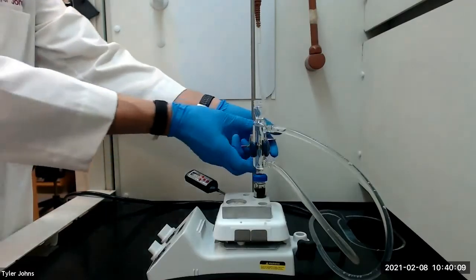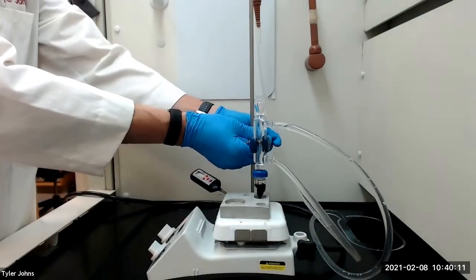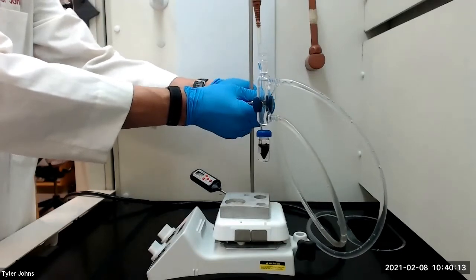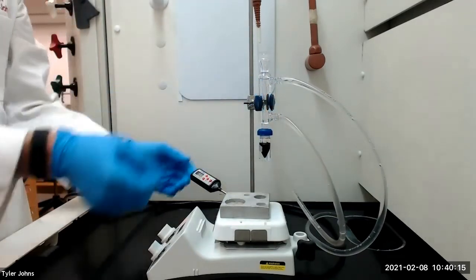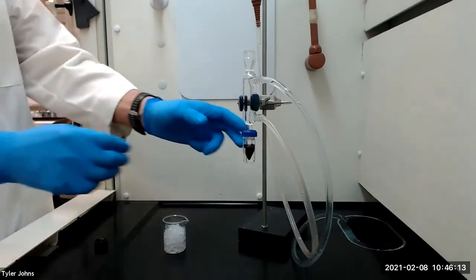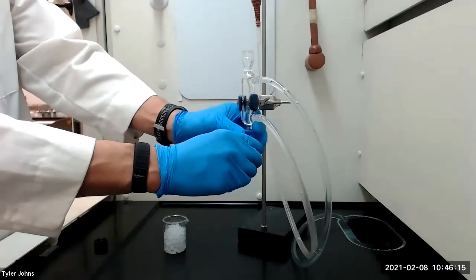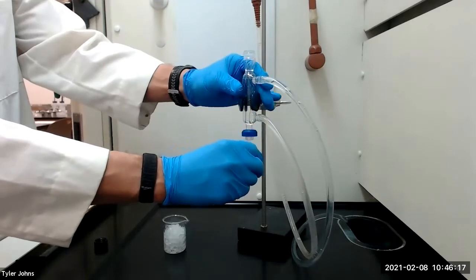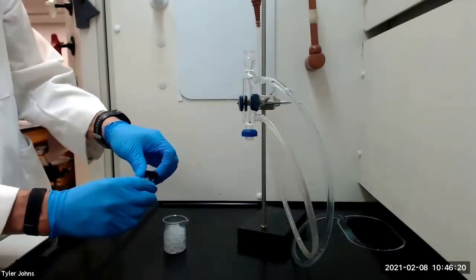After the heating period, we will remove the vial from the aluminum block and allow it to cool to room temperature. After the vial has cooled to room temperature, we will place the vial in an ice bath to complete crystallization.